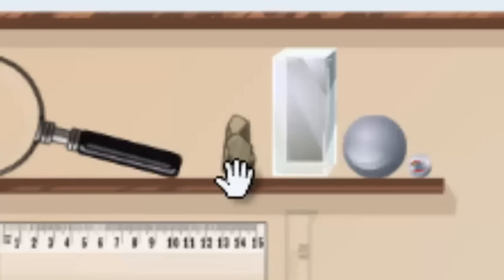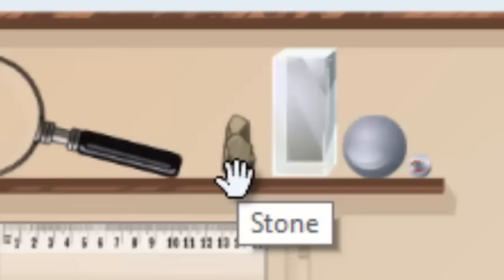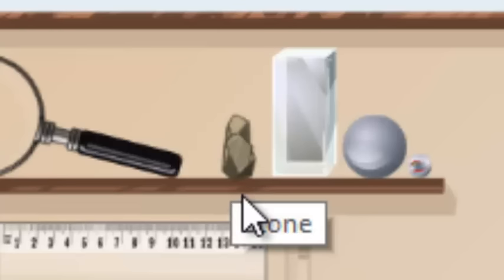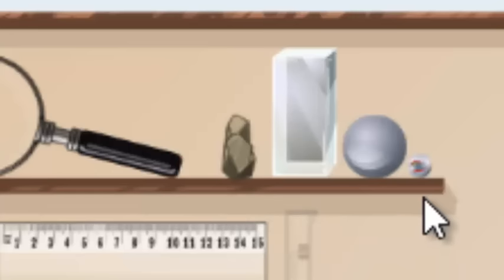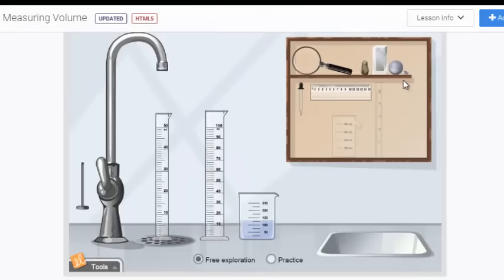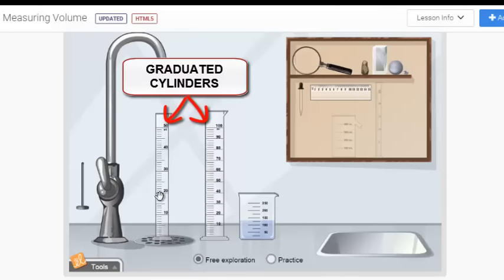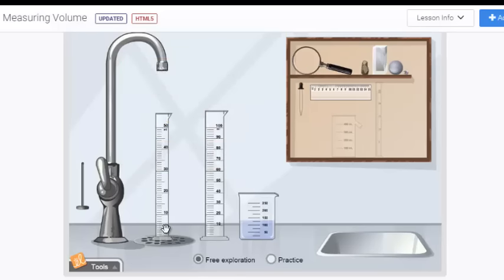However, there are objects that make it more difficult to measure length times width times height because they're not flat and they don't have straight edges, such as this jagged stone or this round sphere or this marble. If you try to put a ruler up to a ball or a marble, you'll notice that it's impossible to measure that. So that's where the graduated cylinder comes into play. These instruments are called graduated cylinders and they measure out volume in units called milliliters. In order to use a graduated cylinder we have to fill it up with water, and there's a couple of ways you should know how to use it.